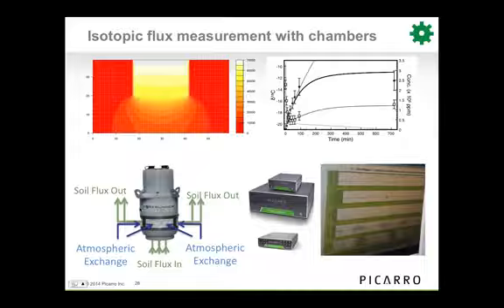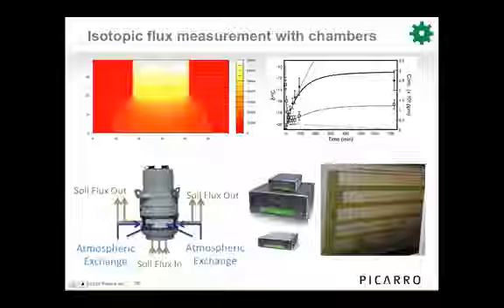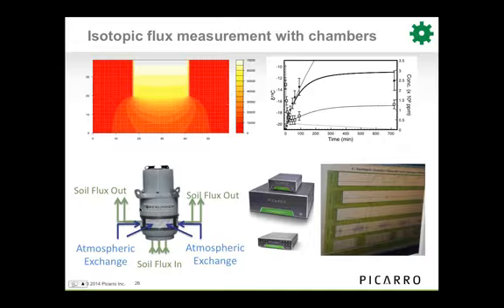And in the forced diffusion chamber, in the simulations we aren't able to get any bias whatsoever, and nor are we able to observe a bias in the experimental results right now, given the precision of the instruments we're using, basically. So for other chambers, it's between 0 and 10, and it depends a lot on the chamber design. And for the forced diffusion, we're sitting down around 0, basically.